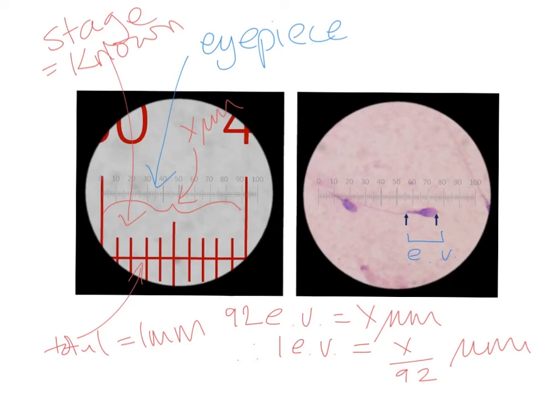When you're doing your measurements, I'd also do a little check, just to check that your numbers are sensible. It's a bit of a sense check. We know roughly how big cells are. We've done quite a lot of microscopy scale bar work, so we know that cells are usually sort of 20, 30 micrometers in size or so. If you've got a number that's radically different to that, then I'd be suspicious.